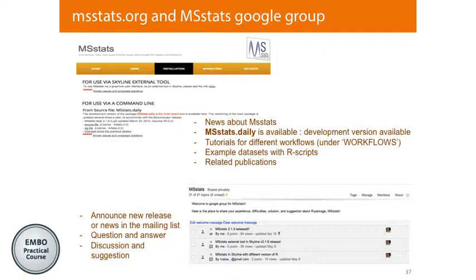And here is the MSstats official website. Here we have news, installation, and all the manuals. We have a 50-page manual for different designs and what you have to consider, like what I presented today. And then there are example data sets and R scripts, so you can just follow them and modify based on your experiment.